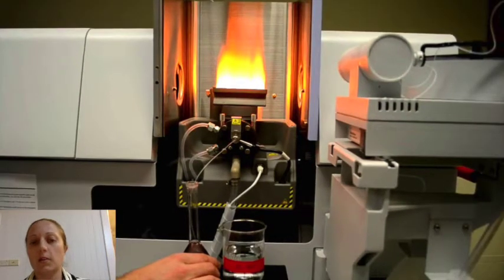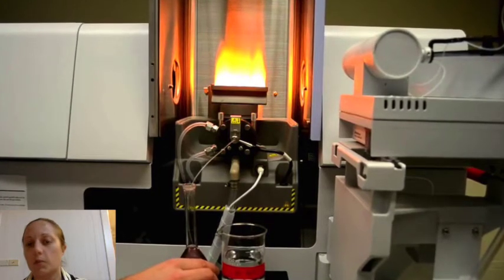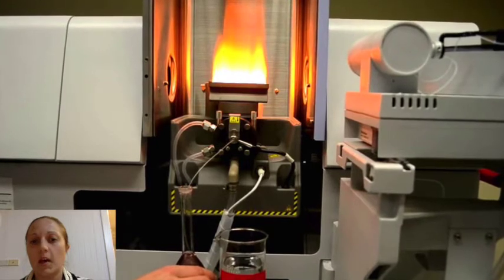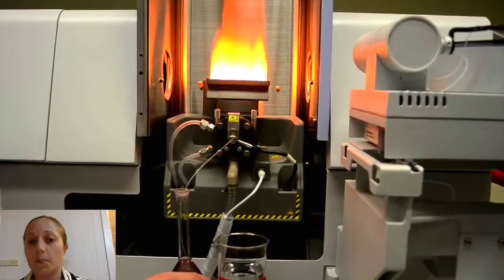The wavelength will then be absorbed depending on the concentration of atoms, and that signal will be sent through to a detector. It's important to note that this process.